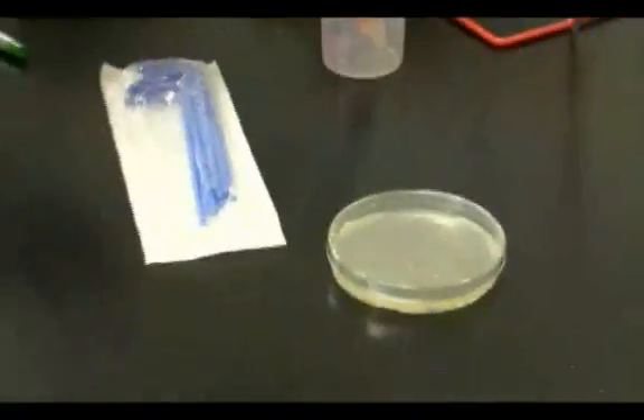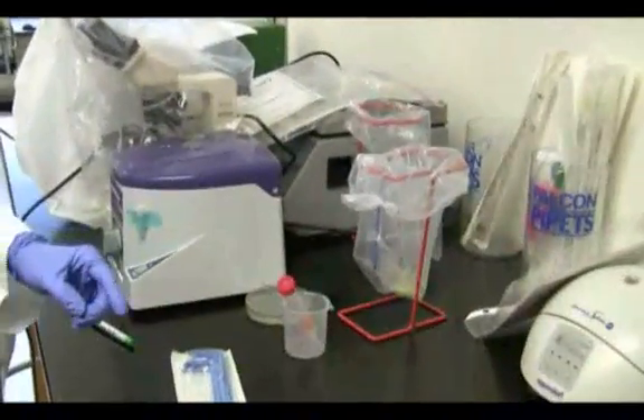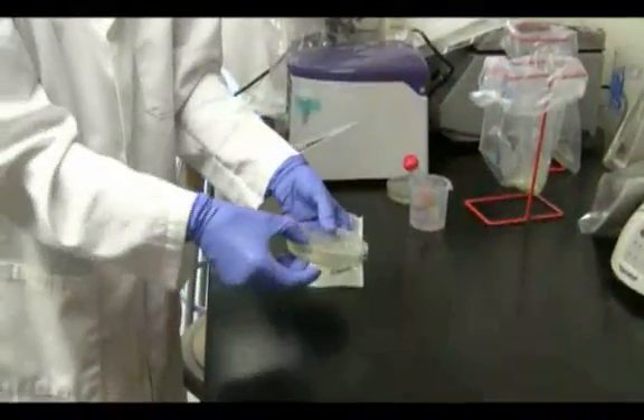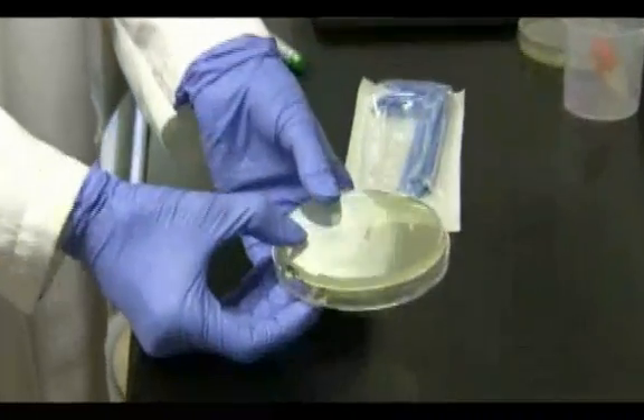Close the lid. Discard the spreader. The plate will be incubated upside down in the incubator set at 37 degrees centigrade.